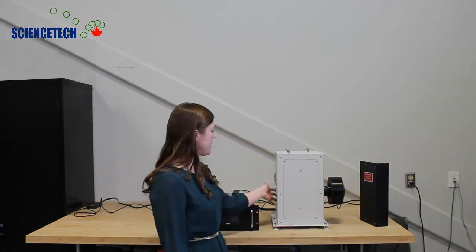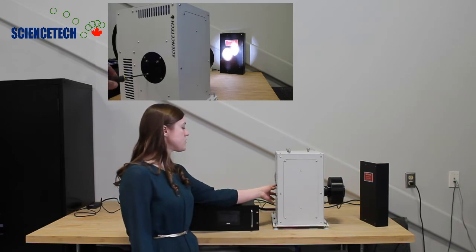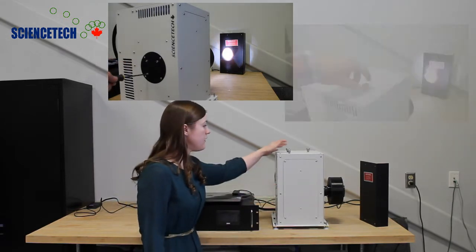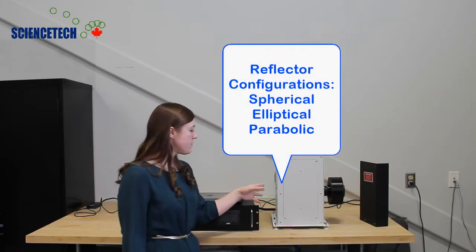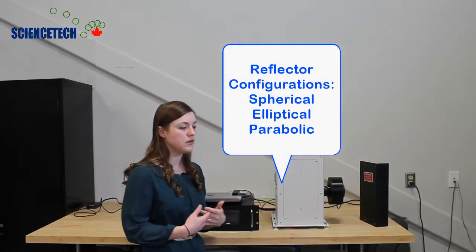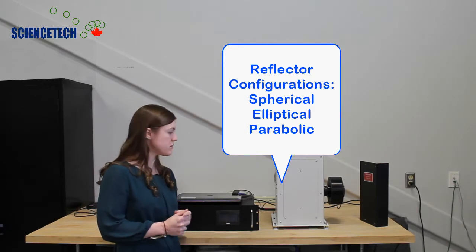On the side here you have these screws for adjusting the reflector and these on top are for adjusting the lamp position. There are a few reflectors available: spherical, elliptical and parabolic reflectors.